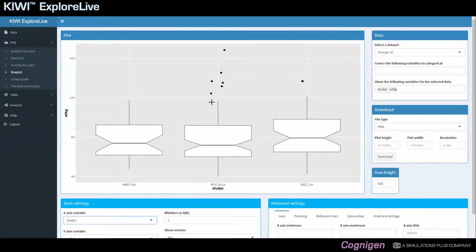And the design of that box is box and whisker. Actually, the design follows the original design proposed by Tukey in the 80s. A box and whisker include a median shown as a line if there is no data stratification. It could be a symbol if stratification is used. I'll show that a little bit later. The box delimits the first and the third quartile of the data. So that's the 25th and the 75th percentile.